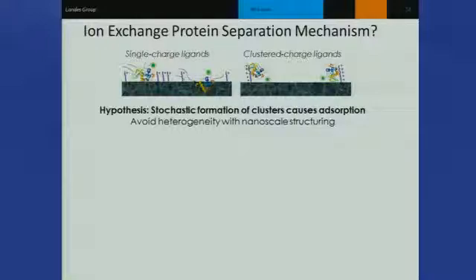As was confirmed in my visit to 3M 3 weeks ago, how you optimize your column is that you choose your ligand and you run an elution, and then you increase the packing density and run an elution, and then you increase the packing density, and you keep going iteratively until you've empirically optimized, and then eventually that tails off again.